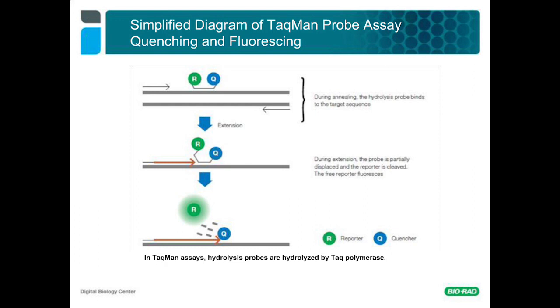Going below this or above this temperature during the elongation or extension portion of the PCR reaction is not recommended and will likely result in a significant loss of activity and thus the number of total amplicons made. Please note, however, that our one-step ddPCR supermix requires a smaller temperature range, as we will discuss more later.